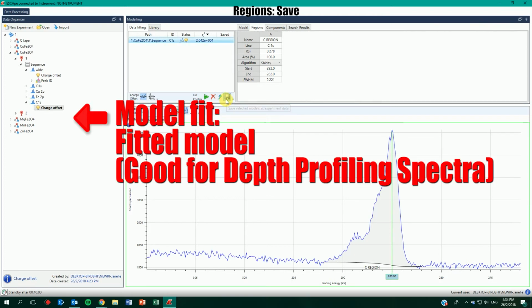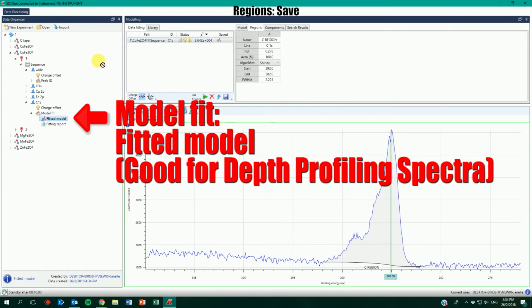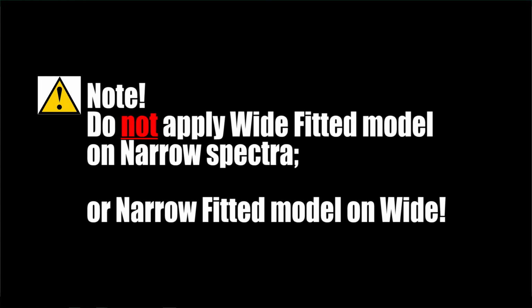A model fit line will appear under the spectrum. Similar to charge offset, you can apply this region's fitted model to other spectrums after saving. This is especially useful for depth profiling, where you get many similar spectra. Note: do not apply a wide spectrum model on a narrow spectrum or vice versa.